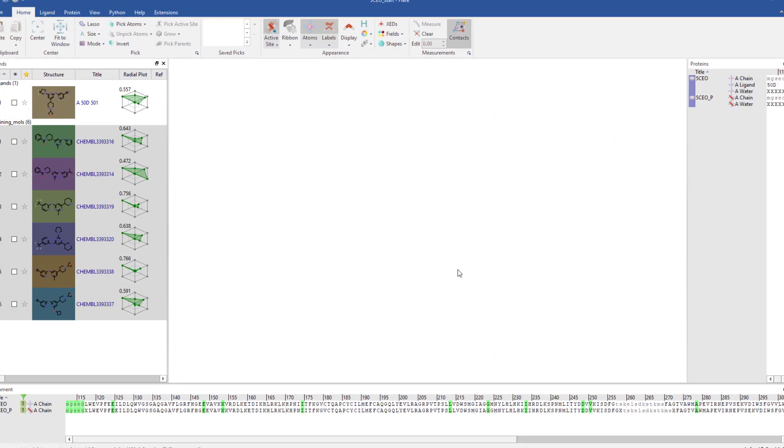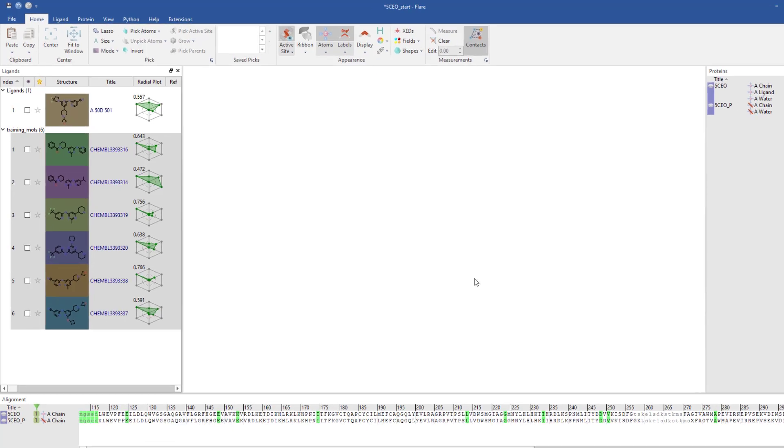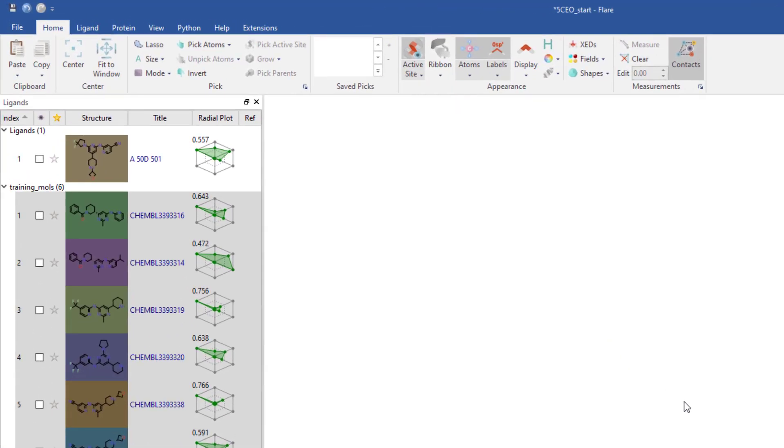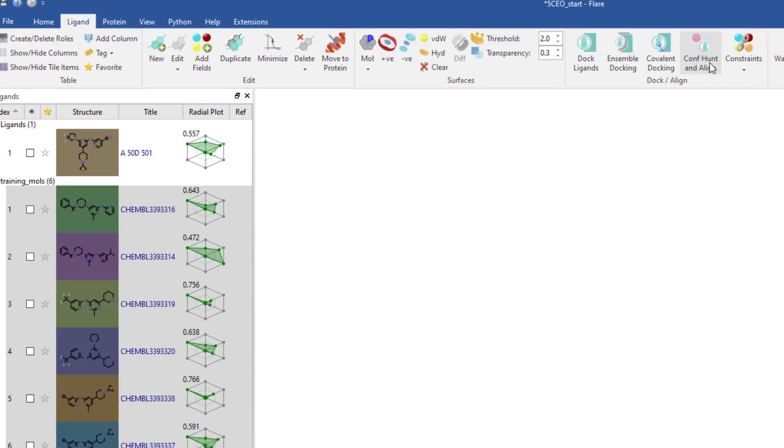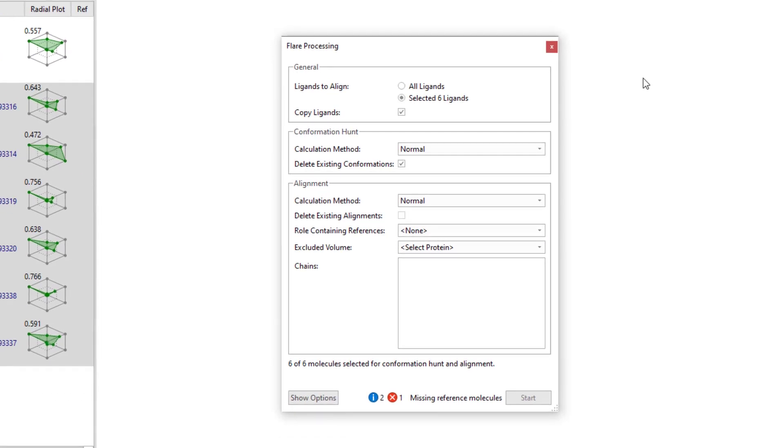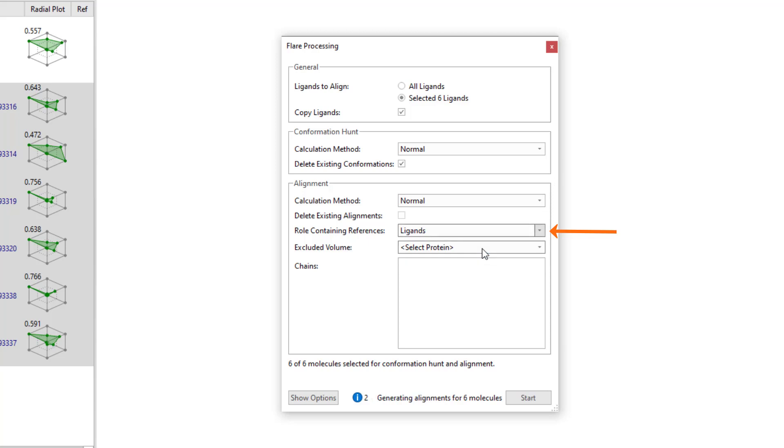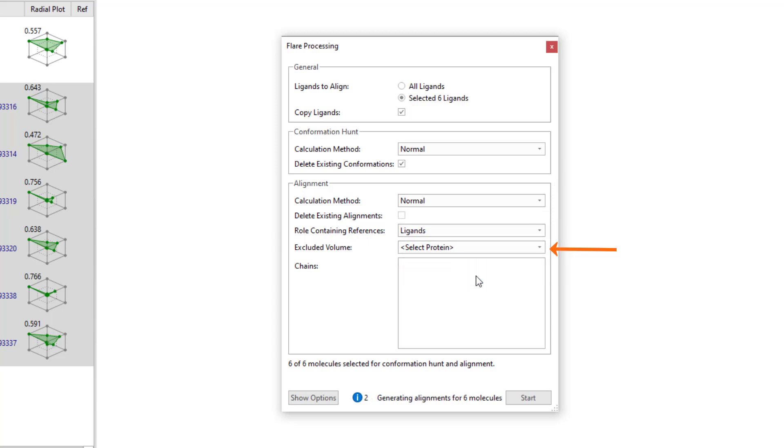I will now set up the confirmation hunt and alignment by ensuring all the ligands are selected, going to the ligand tab and hitting the Conf Hunt and Align button. I will specify the reference ligand and include the prepared 5CEO protein as an excluded volume, not considering any water molecules.